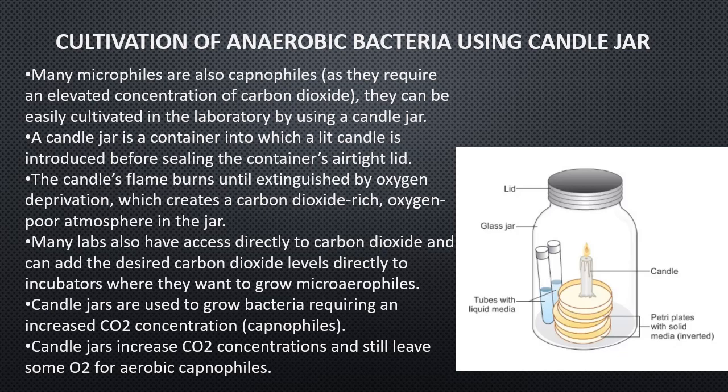Then next is the candle jar, a very basic experiment of oxygen and burning. Oxygen supports burning, and that principle is applied here. Many microaerophiles are also capnophiles, as they require an elevated concentration of carbon dioxide. So many microaerophiles are capnophiles, which means they require high concentrations of carbon dioxide to grow. They can be easily cultivated in the laboratory by using a candle jar.